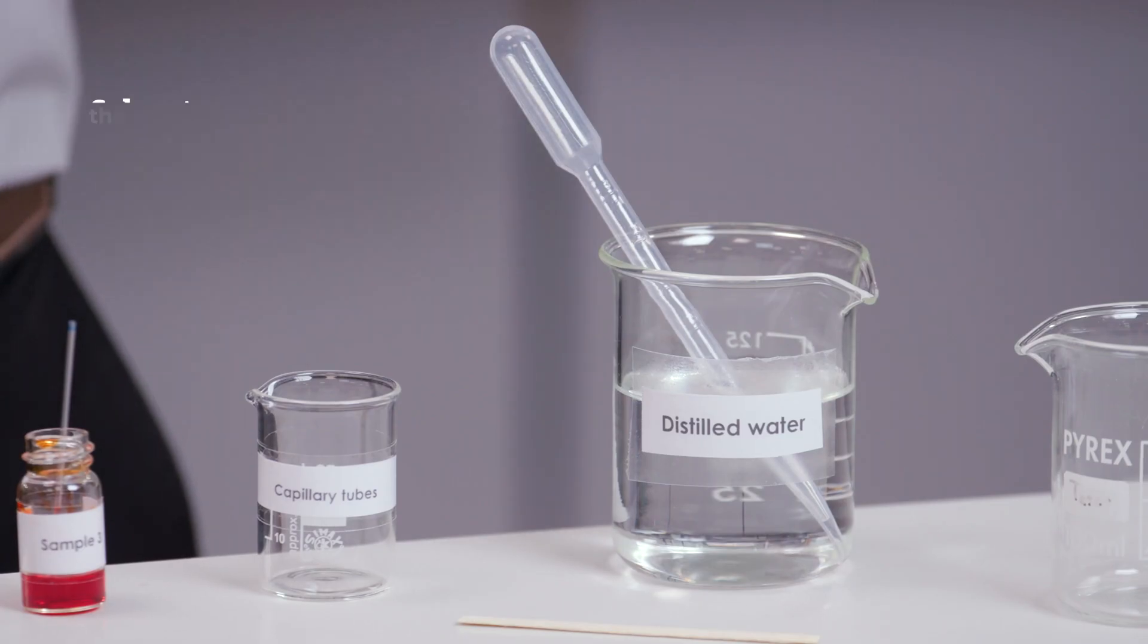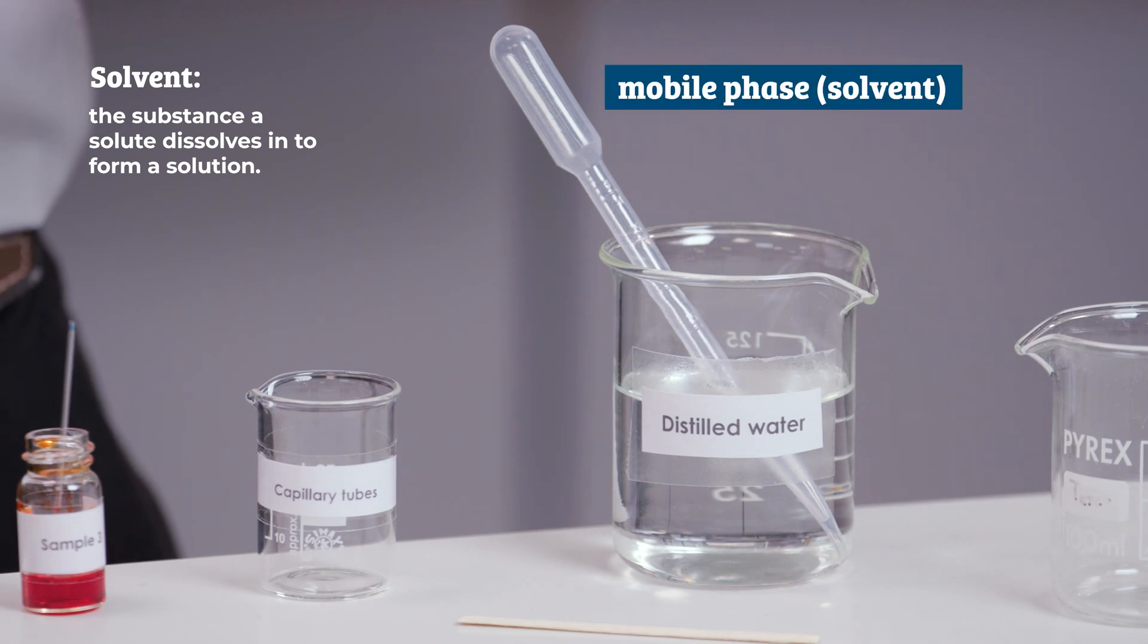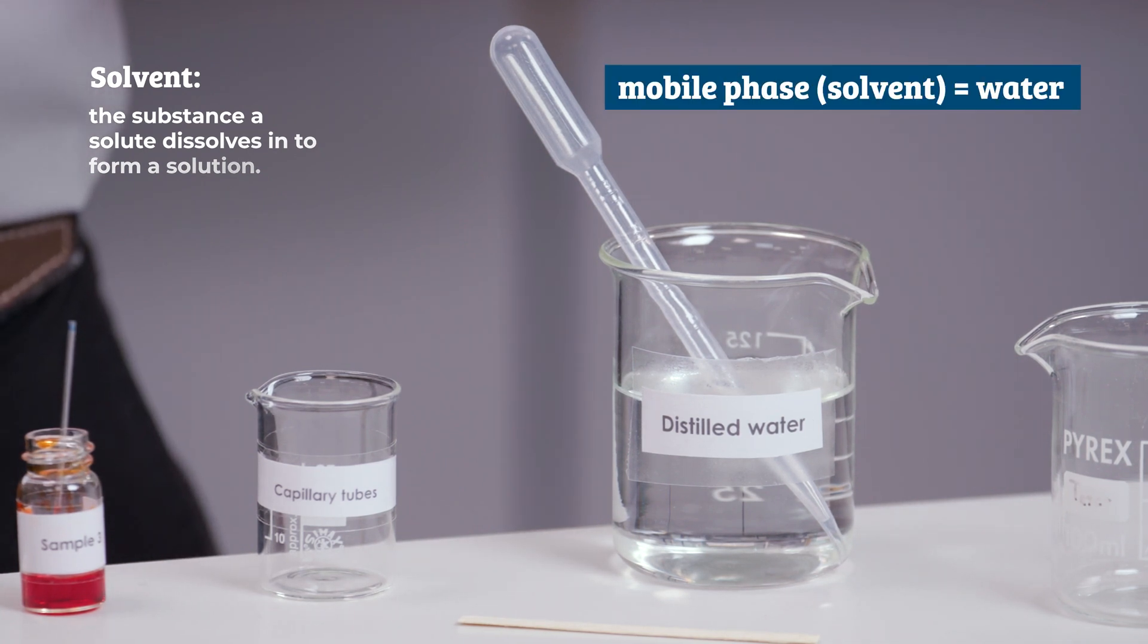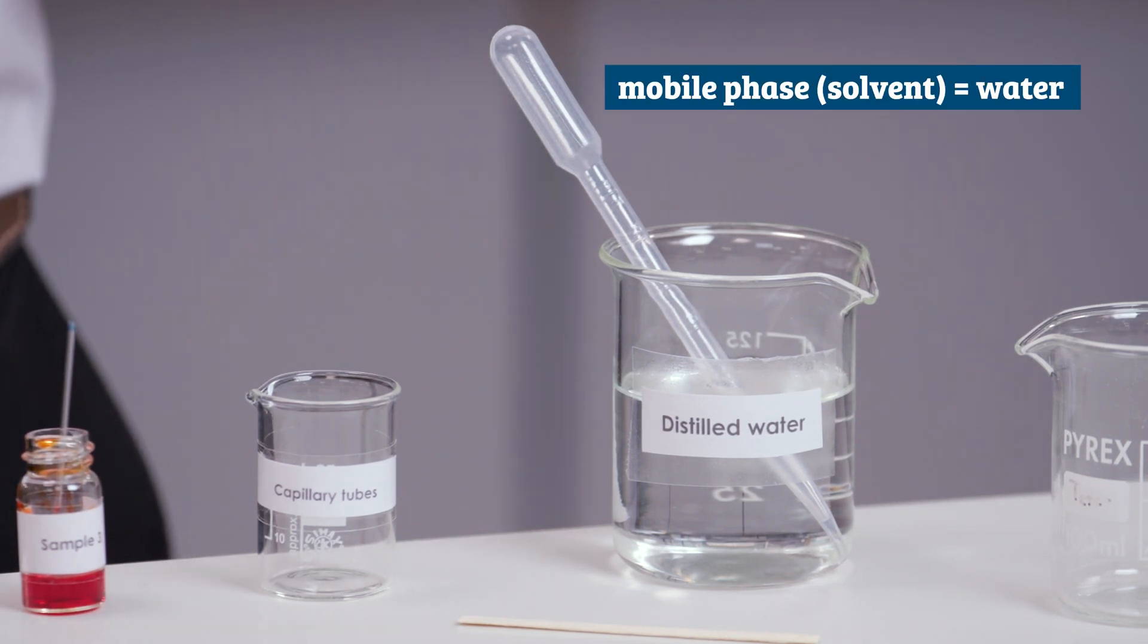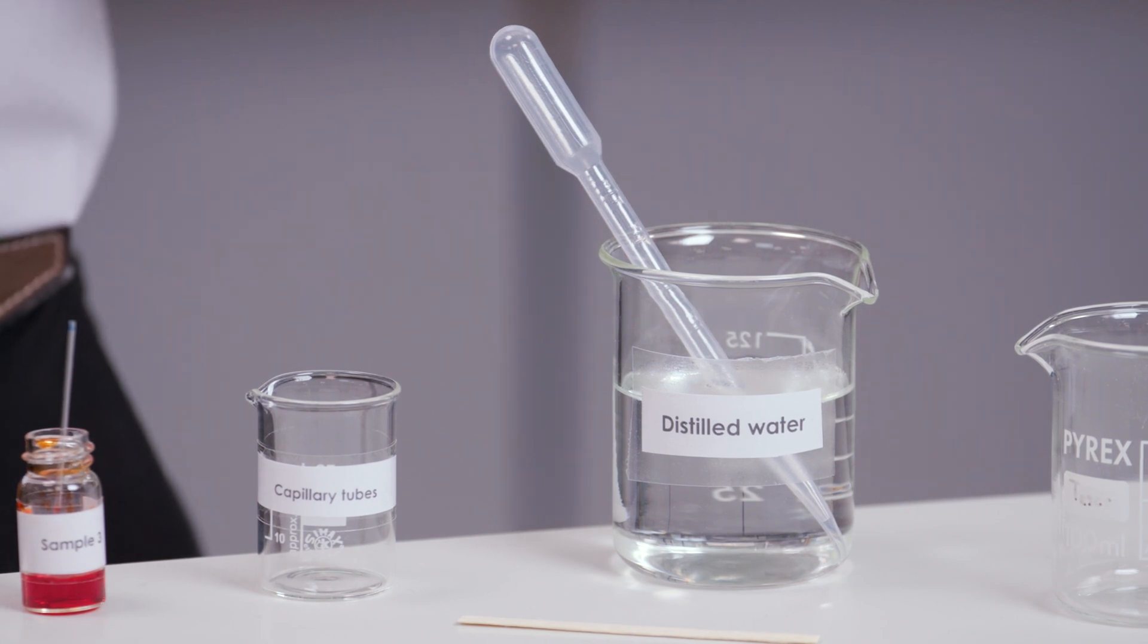I'm using water as the solvent. We call the solvent the mobile phase because it moves. If an ink is soluble in water, paper chromatography will separate all the substances, the different colours, in it.